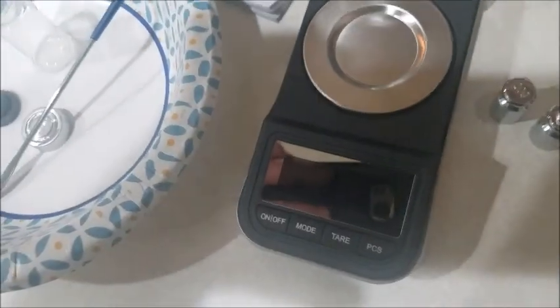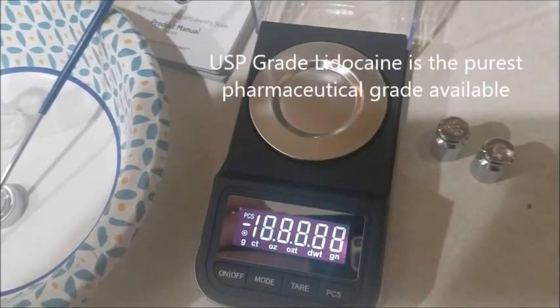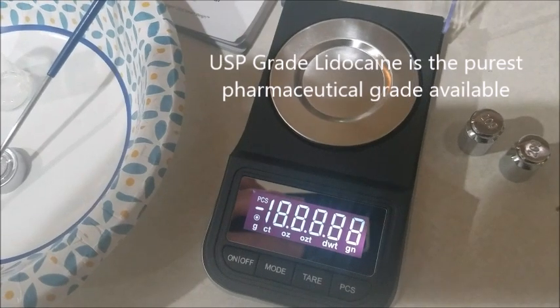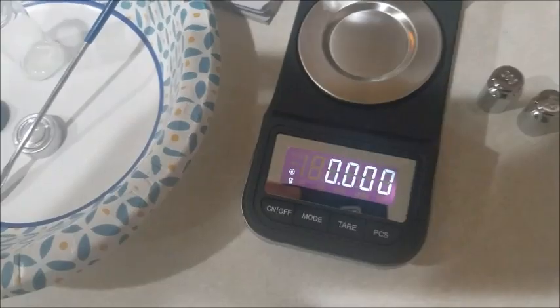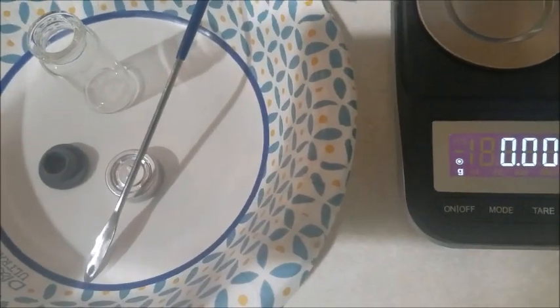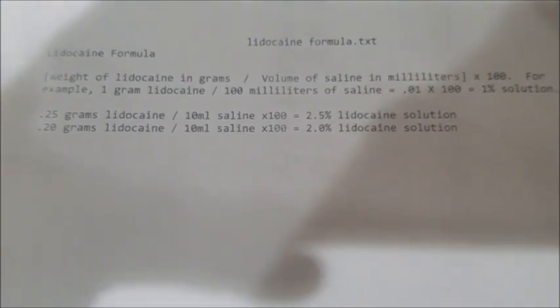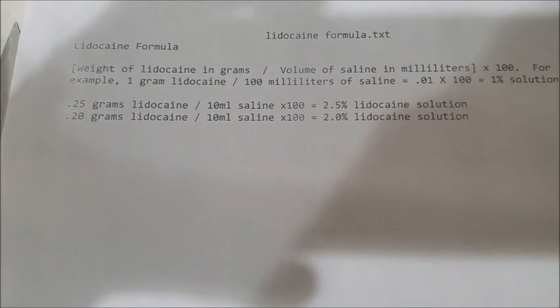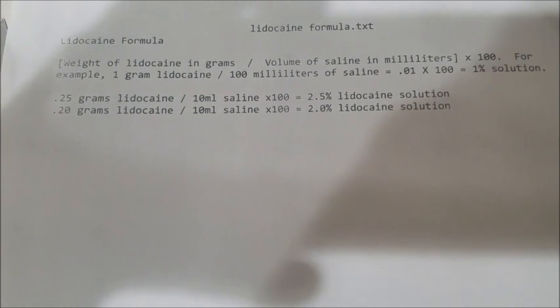The second step is going to be to weigh the appropriate amount of lidocaine USP powder onto this scale to make the correct solution you want. The solution that I want to use is going to be a 2.5% solution of lidocaine. So if we look at our ingredients here, we're going to need 0.25 grams of lidocaine USP powder and 10 milliliters of saline.